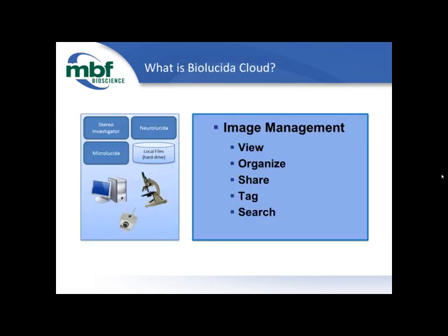All right, Jeff, take us through the major one here. What is Biolucida Cloud? Well, at its core, it's essentially about image management. And by management, I mean the ability to view, organize, share, tag, and search image data. The easiest way to actually explain it is to describe one of the problems we're trying to address with Biolucida.